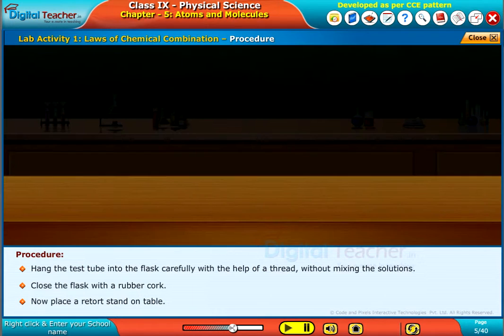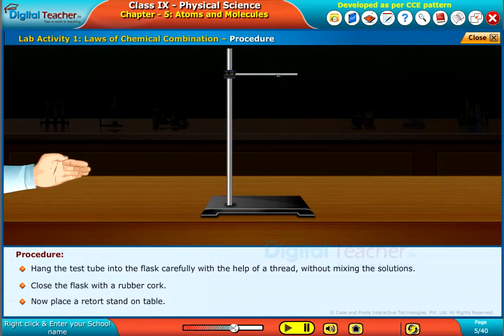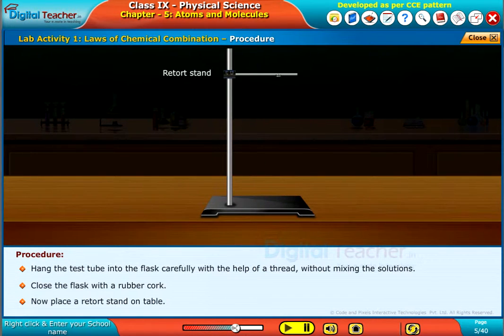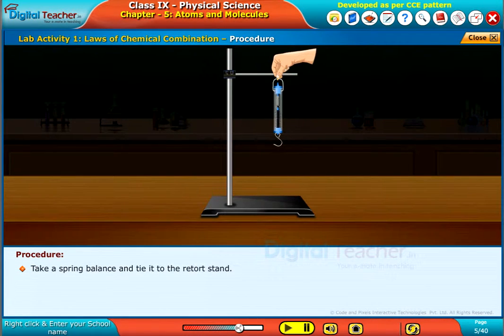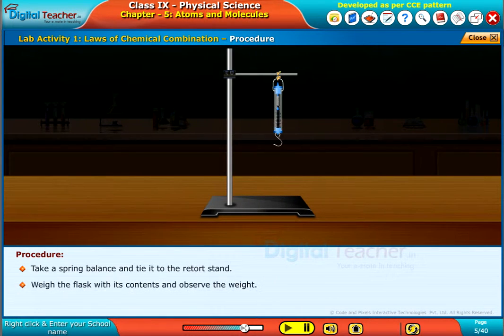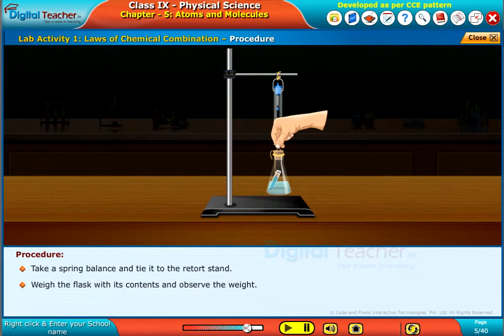Now place a retort stand on the table. Take a spring balance and tie it to the retort stand. Weigh the flask with its contents and observe the weight.